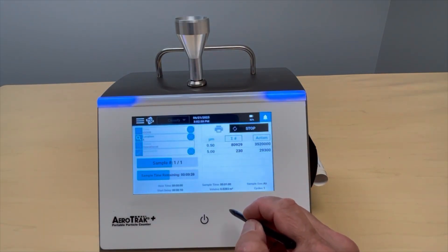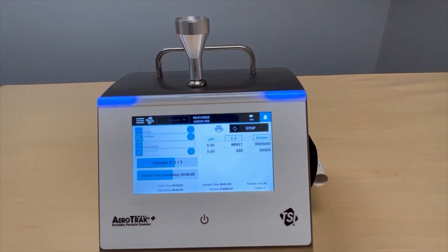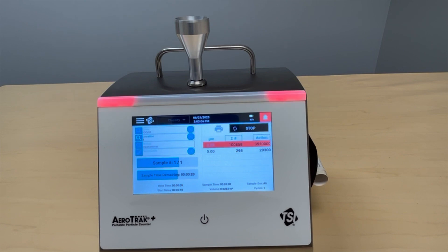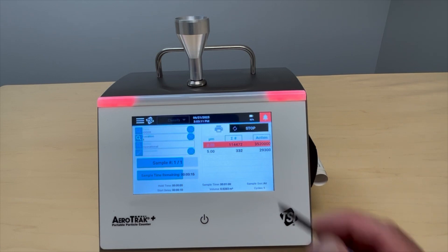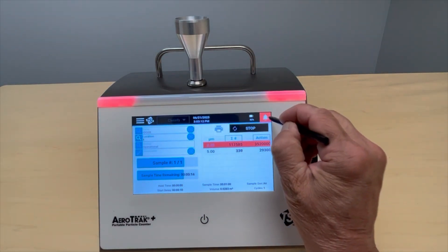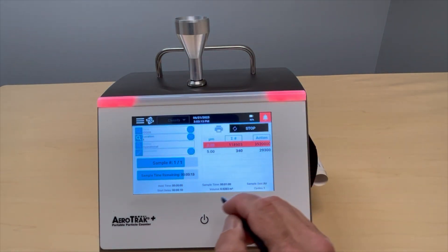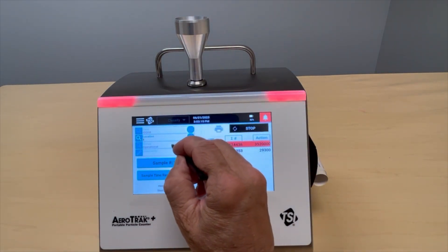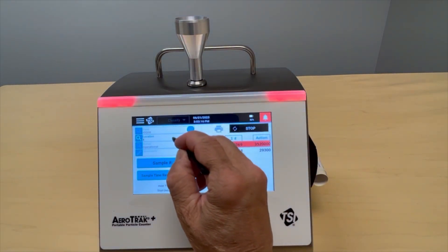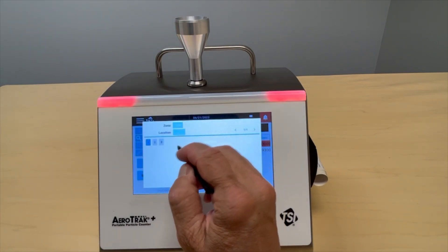We heard a lot from users who talked about how complicated it was to take samples for classification. The A100 makes it easy because the programming menus are super simple and intuitive to use, and when you are sampling, the features of the instrument make it impossible to miss an out-of-tolerance.